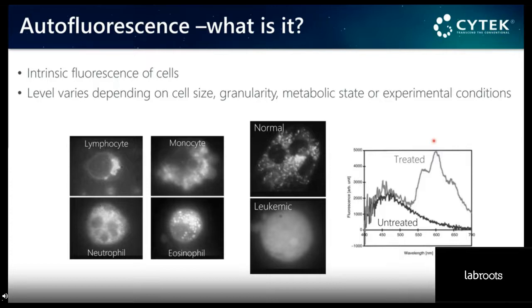So multiple differences in that autofluorescence, in the different parameters for that autofluorescence characterization, and how that changes based on cell size, granularity, the metabolic state, and different experimental conditions as we are seeing here.